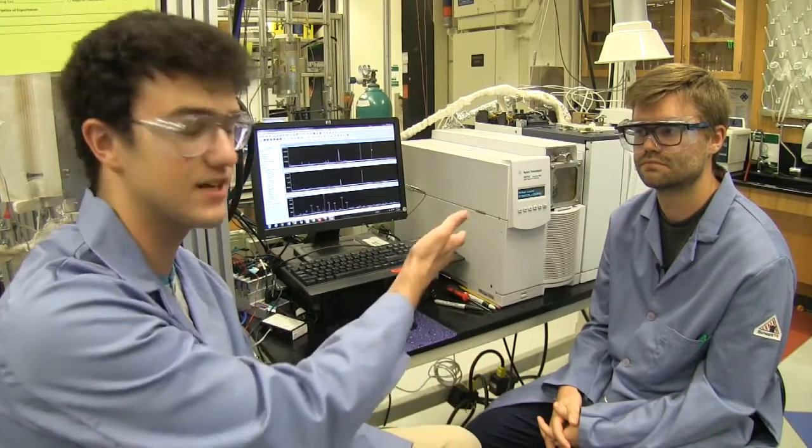So once we're done with the reaction, we'll take a sample and we'll put it on this machine here called a gas chromatograph with mass spectrometer. The gas chromatograph tells us how much products we made and can separate them. And then the mass spectrometer tells us what each of those products is so we can see if the reaction is creating the compounds we wanted to create.